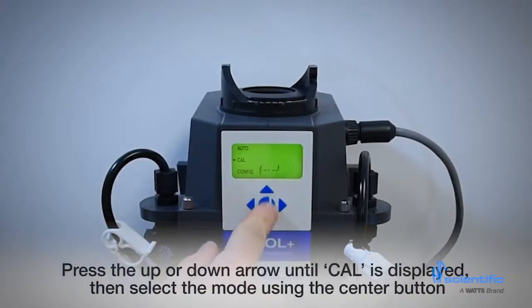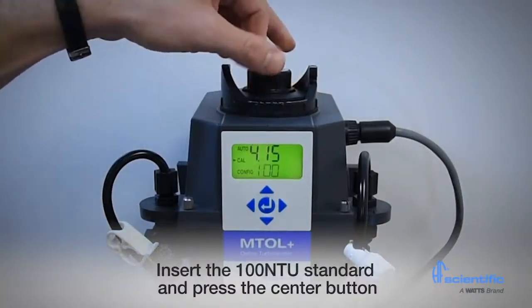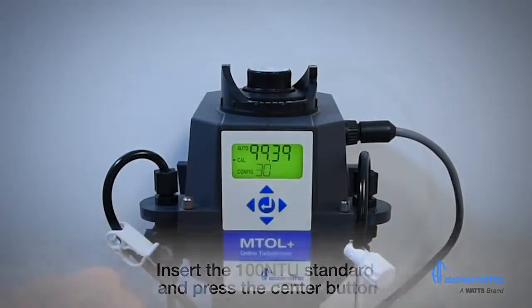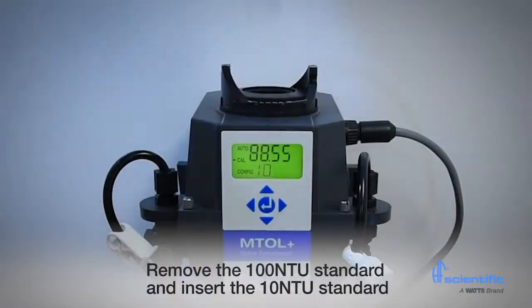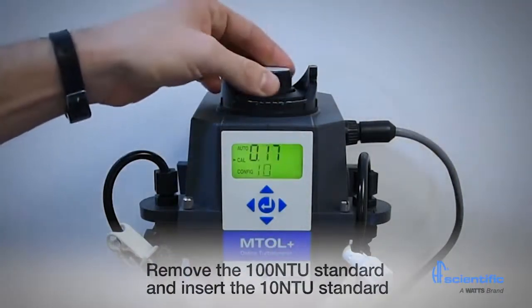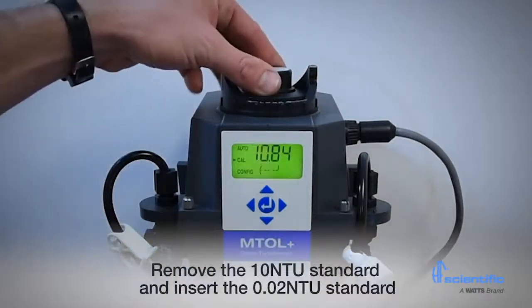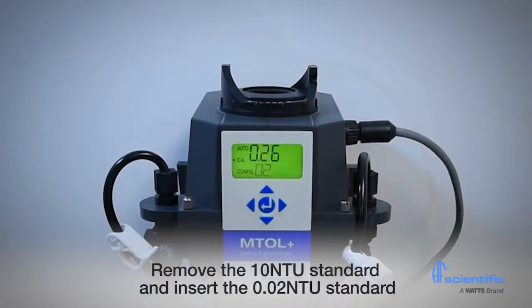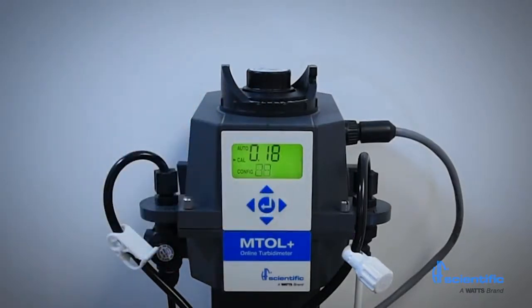To start, press the up arrow until CAL is displayed, then select mode using the center button. The instrument will display 100. Insert the 100 NTU standard and press the center button. The instrument will count down 30 seconds and then display 10. Next, remove the 100 NTU standard and insert the 10 NTU standard. Press the center button. The display will count down 60 seconds and then display 0.02. Remove the 10 NTU standard and insert the 0.02 NTU standard. The display will count down 30 seconds.